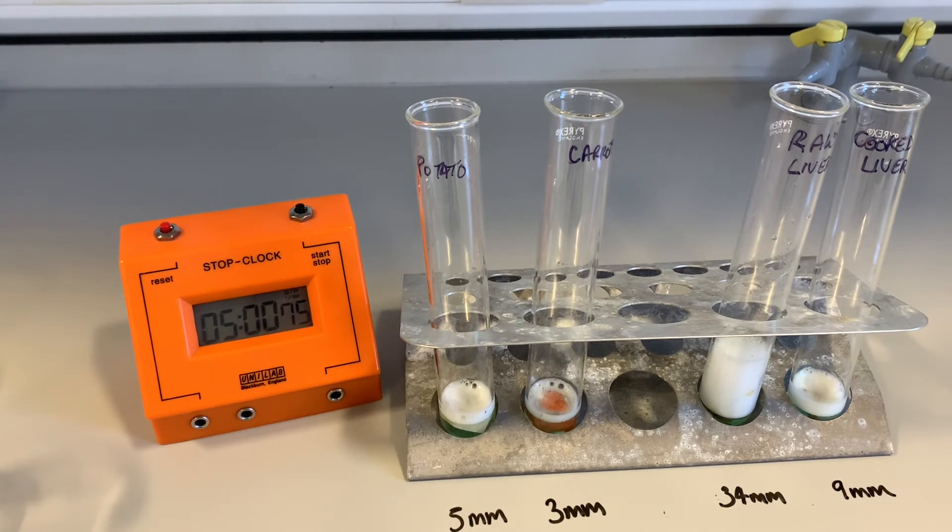In that five minutes, each of the living tissues has got an enzyme called catalase in it. What catalase is able to do is break down the hydrogen peroxide into oxygen and water. So the more catalase the tissue has, the more oxygen is produced, therefore the more froth that we are able to measure. The one that's surprising is the cooked liver.